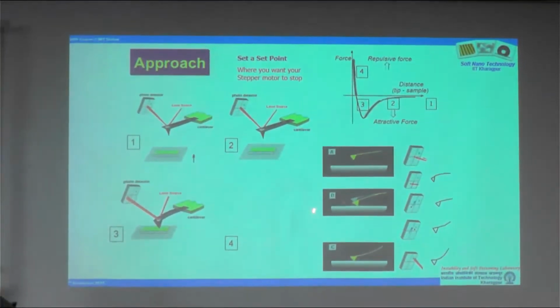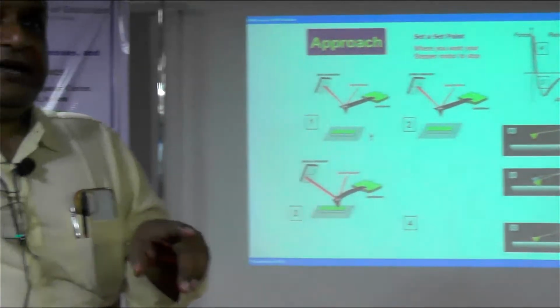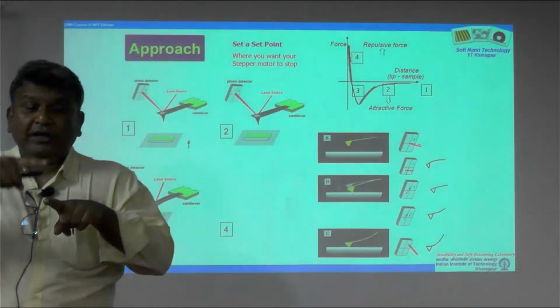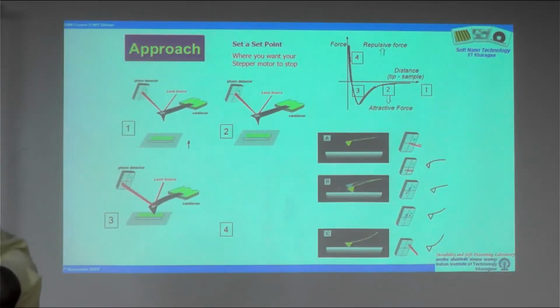But now you understand why we have taken a cantilever. In order to be a good atomic force microscope tip, its stiffness should be such that it is sensitive to these tiny forces. And that is again a micro manufacturing wonder, right? Now as the tip and the surface start coming close to each other, there is an attraction between the tip and the surface due to the collective effort of the van der Waals attraction of all molecules, and consequently the tip now bends, right? And eventually they come in contact, but we call it the jump to contact.